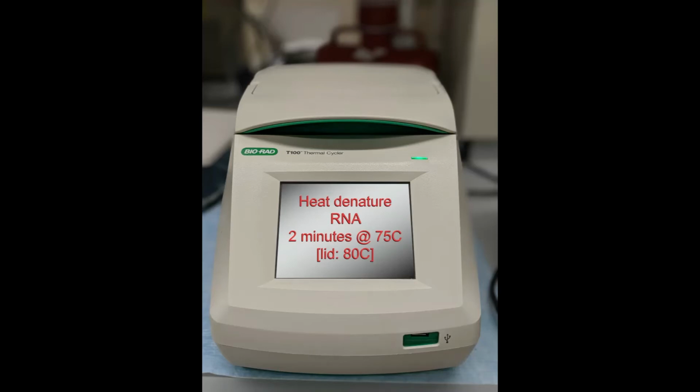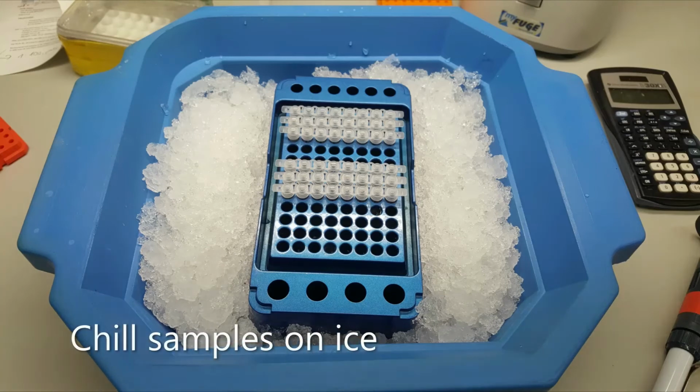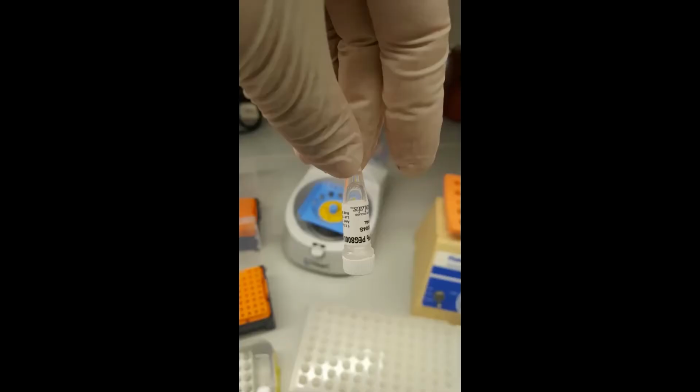Fetch your input RNA from the freezer, and once everything is ready, heat denature the RNA at 75 degrees for 2 minutes, as done previously. Quick chill the samples on ice and start preparing your RppH master mix. This is an art by itself. While the crowder PEG is not essential for this reaction, it facilitates adapter ligation downstream in the protocol. However, given the viscosity of PEG, it is now important, particularly in the first 2 steps, to vigorously mix your samples.